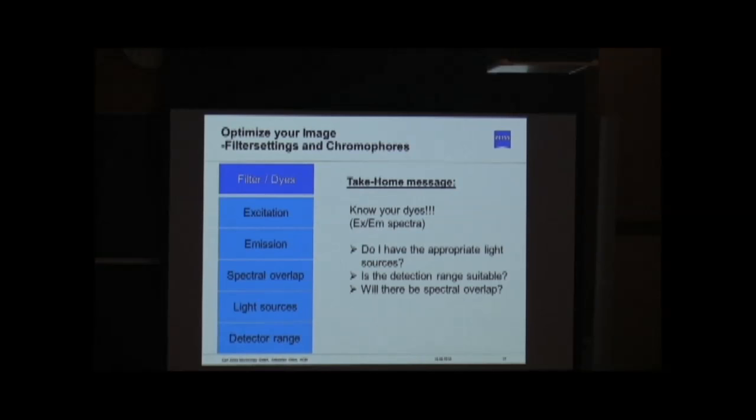Okay, move on to the next topic, filter settings and fluorophores, or chromophores. The take home message that I would like to pass on to you with respect to that, and this is really crucial, is please know your dyes. Know the excitation and the emission spectra of the dyes that you actually apply for your staining, for your protein expression.